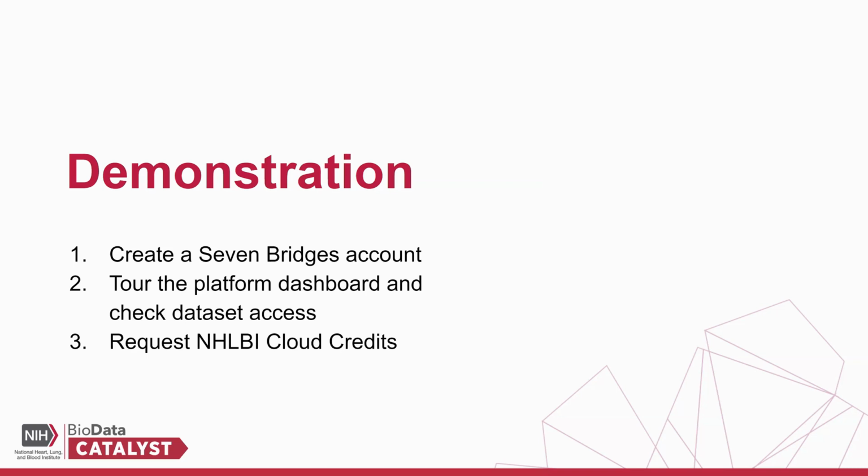For this video's demonstration, we are going to do the following. The first is I'm going to show you how you would start to create a 7Bridges account and what screen you need to go to do that. The second is we're going to tour the platform dashboard and check dataset access inside of the Biodata Catalyst powered by 7Bridges platform. By the way, the platform dashboard is the first screen, sort of like the home screen users see after they log on. Finally, I'll show you how you can request NHLBI cloud credits to start to fully test out the platform on your own.